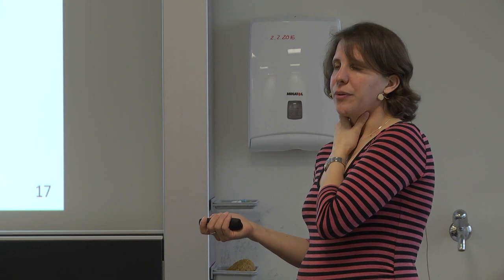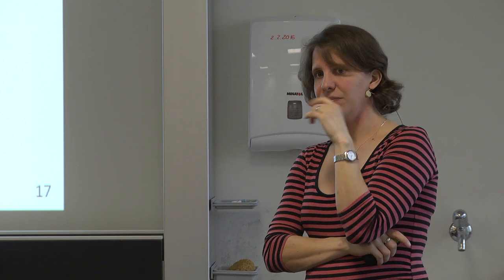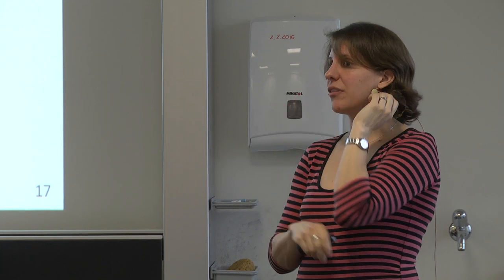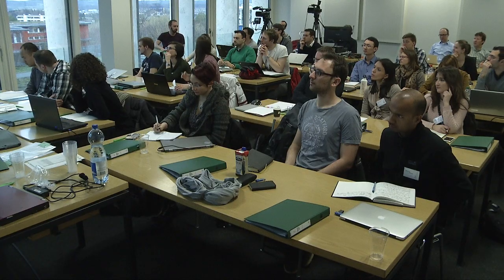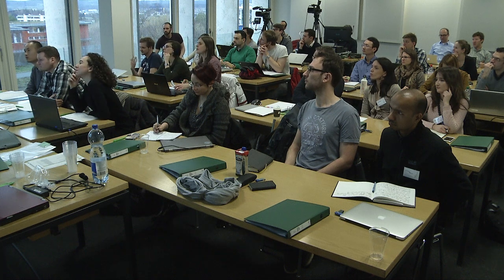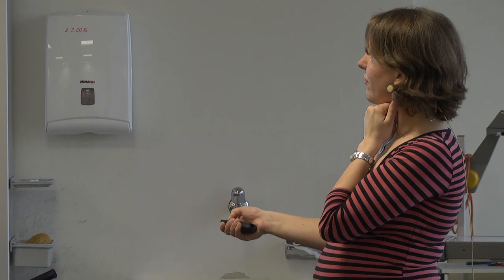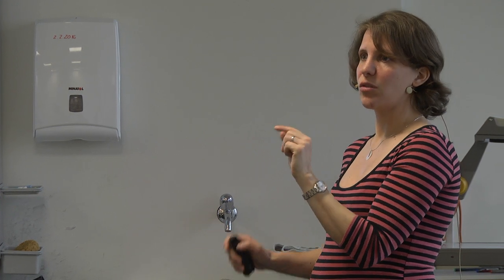But isn't that a big problem now? We should exclude those transitions for quantification, no? Because they will pollute. We will see the sum of both forms. The Q1 is different, so you don't select them together? Exactly. The big difference is that we also have this mass difference in Q1. And as the isolation window width in our triple quad is usually in the range of 1 Dalton, and we are here 4 Daltons apart, it should be no problem. The mass spectrometer should separate it.